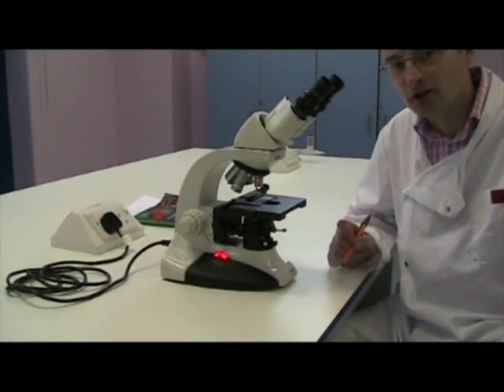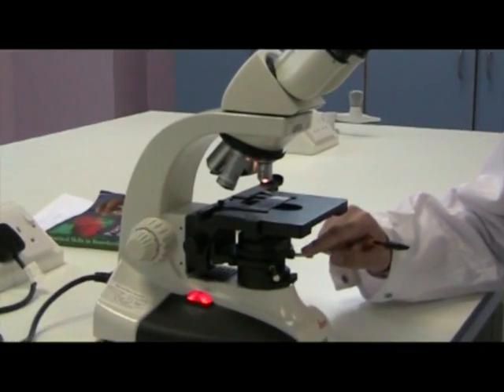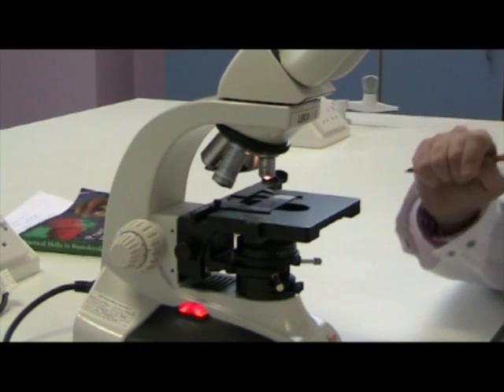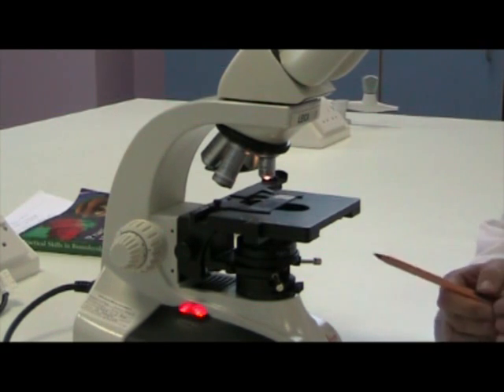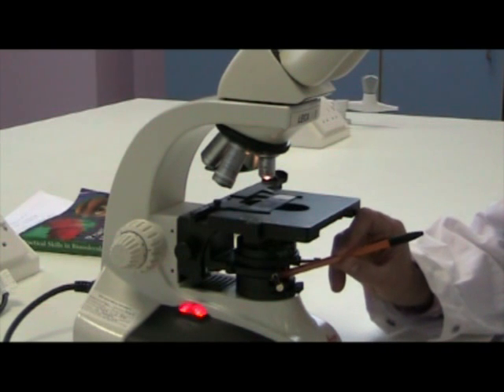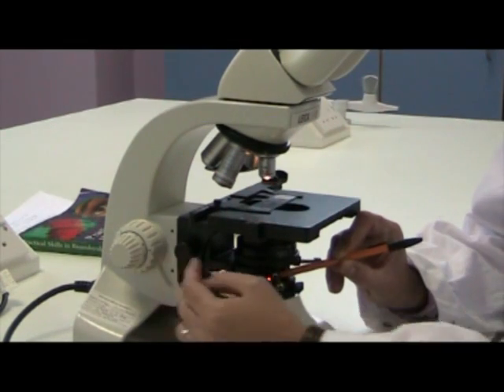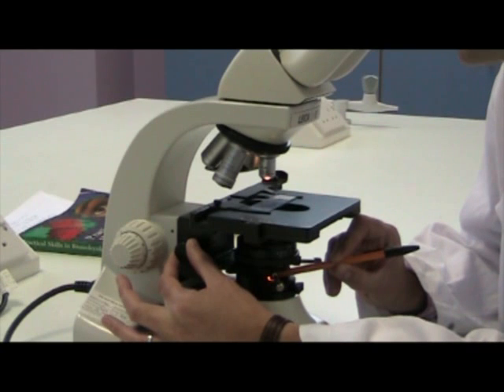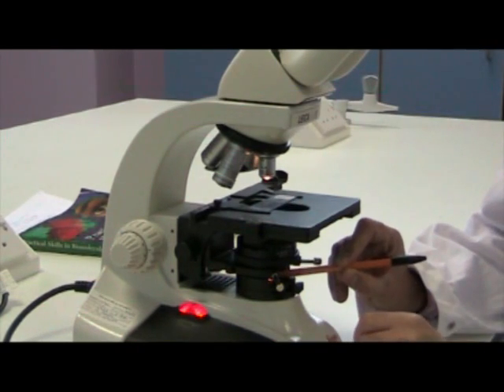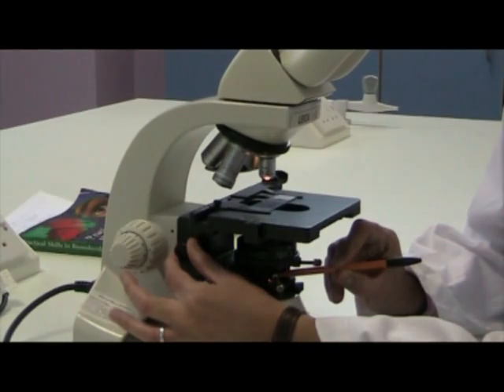Next, we have to focus the condenser lens. The condenser lens sits above the light source and it focuses the light source onto the specimen. The way that we focus the condenser lens is we take something with a sharply defined tip like a pen or pencil, and we carefully hold it over the light source — so we put the pencil above the light source. Then we look down the microscope and focus the condenser lens using this button here. We turn it up or down, and what we want to see is both the specimen and the tip of the pencil in focus. That we achieve by moving the condenser lens focus button.